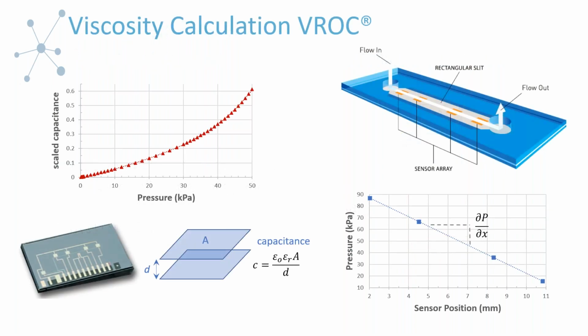Okay, so we know we've simplified our constitutive relationship down, and we're going to have to look and see how, from our instrumentation, we're going to calculate shear rate and shear stress. I'm going to spend a little more time on our instrumentation because we're most familiar with that, but then I will also talk later about the calculations that are used for a couple of different geometries on the rotational side.